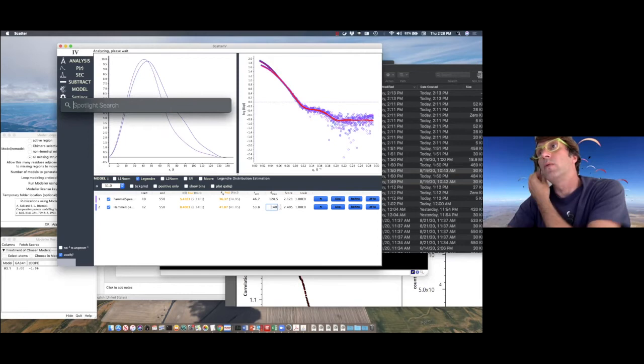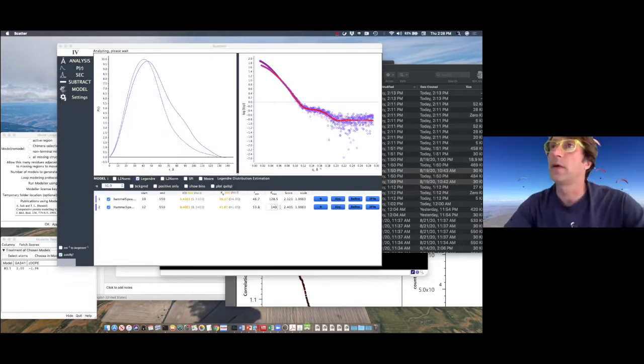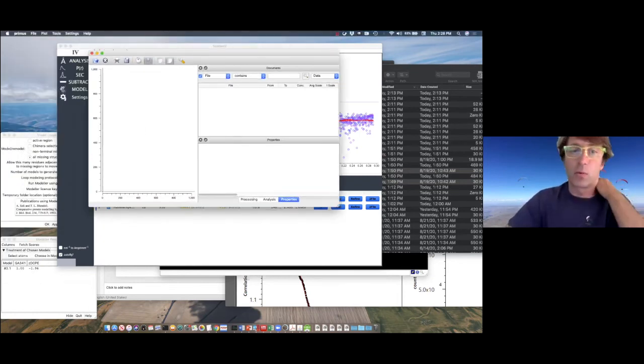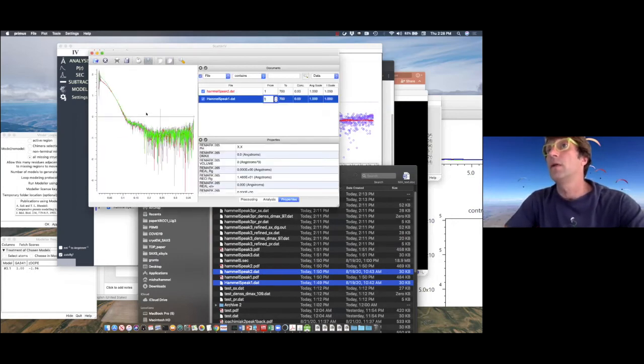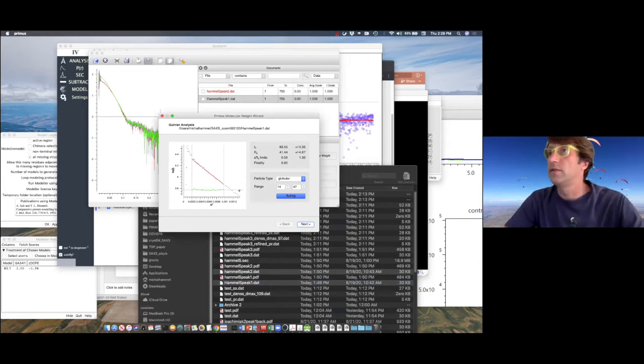I will bring up the Primus, just to show you, because it would not be fair to our users to not show that there are tools in Primus available as a fast way to calculate the molecular weight, or at least confirm what you see in the MALS. That's what I do as well very often. So here are our 2 peaks on the plot, and there is a type of analysis called molecular weight, and it defines the resolution.